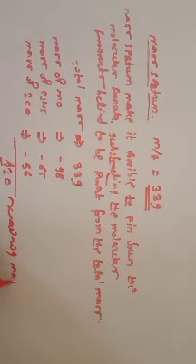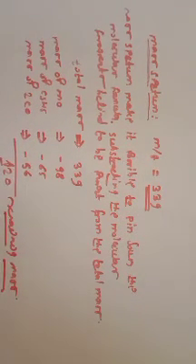This is your remaining mass. So this much mass remains in the product. Okay, and what is the fragment for this 120 mass?